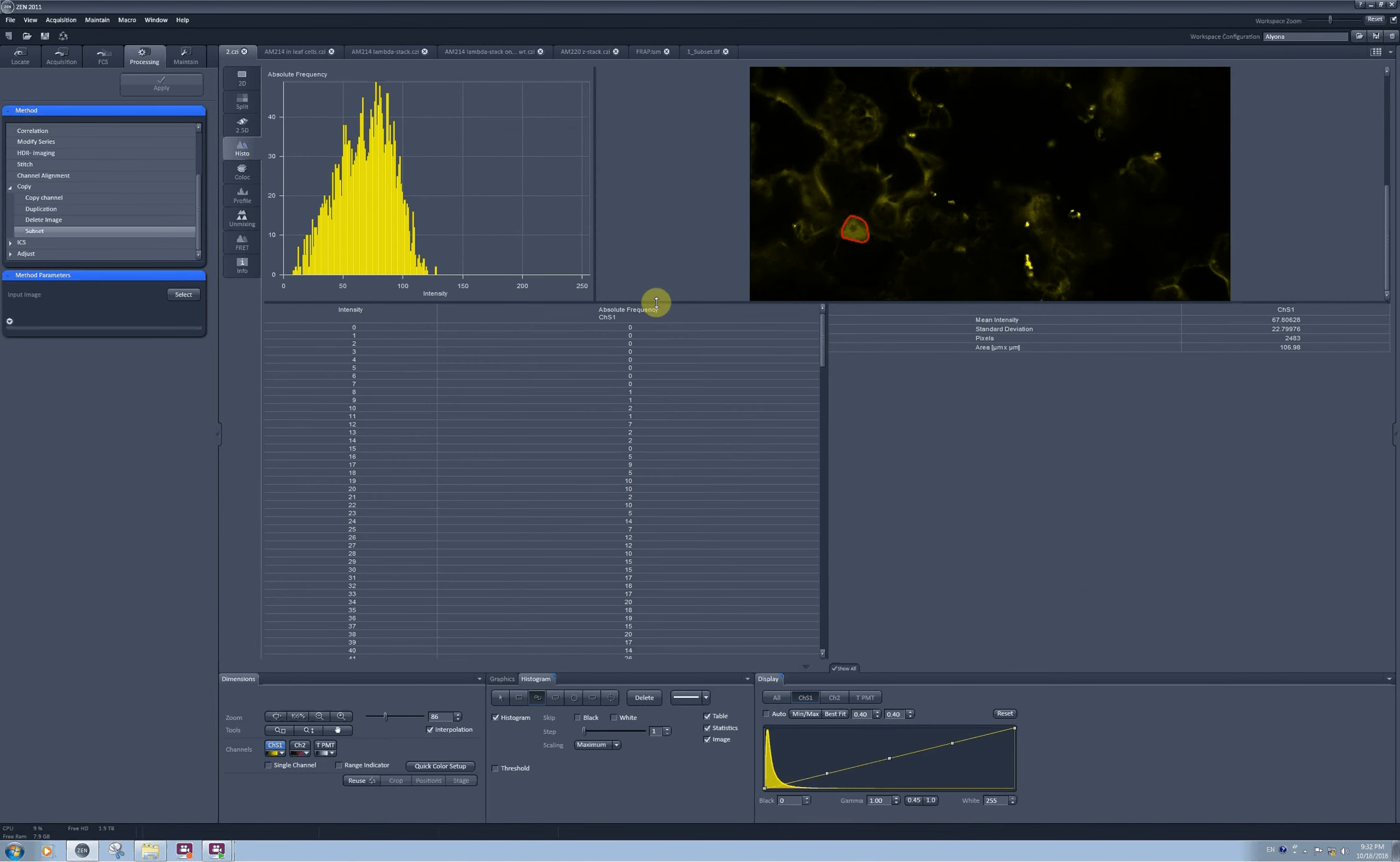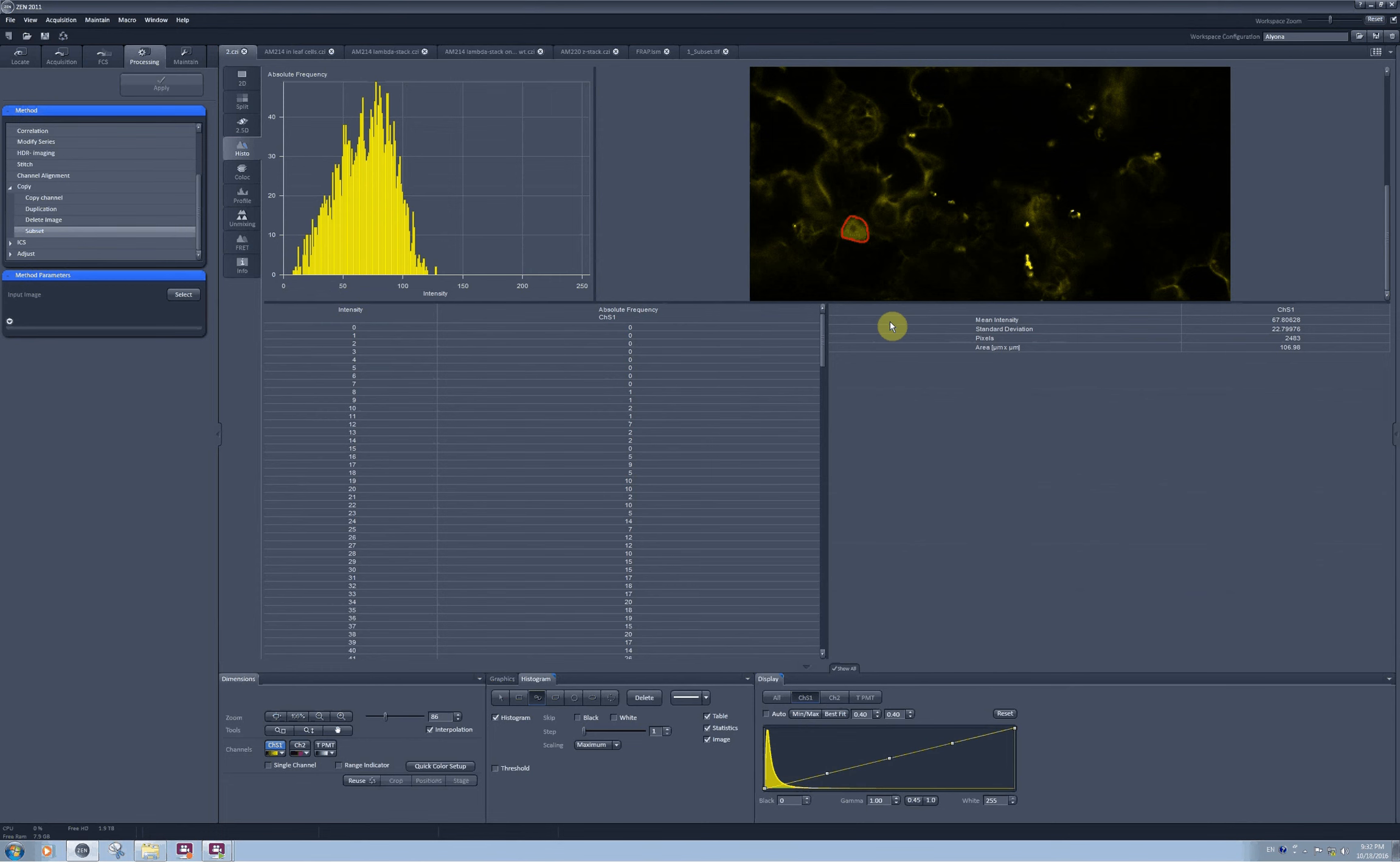To be able to save this data, you need to right click on the table and click on copy table, and then you can paste it into excel sheet.